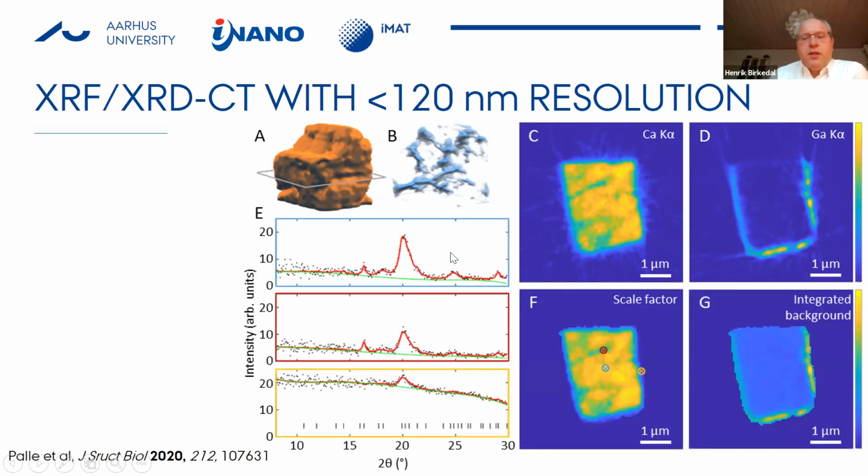If we then look at the diffraction signal, which we treated by Rietveld refinement, the amount of crystals is given by the crystallographic scale factor, and we can see a very good correspondence between the calcium signal from fluorescence and the local mineral crystal content as determined by diffraction.